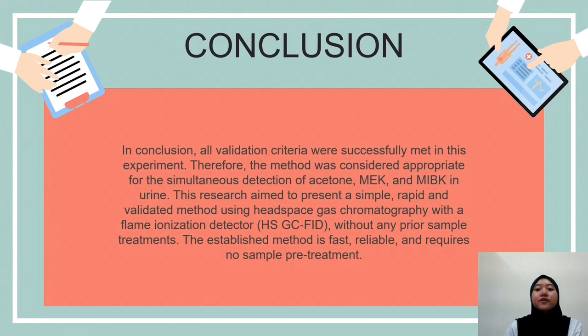And the objective of this experiment was accomplished, which is to present a simple, rapid, and validated method using headspace gas chromatography with a flame ionization detector. The established method that was used in this experiment is fast, reliable, and didn't need any sample pre-treatment.